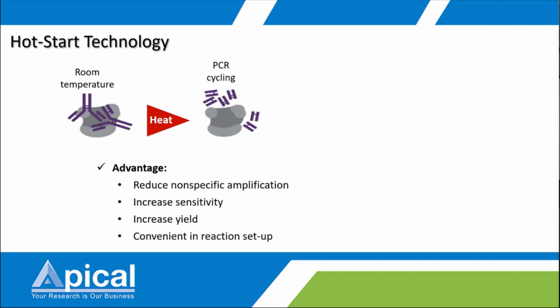Okay, so another characteristic of DNA polymerase, or I should say an advancement in DNA polymerase technology, is the hot start technology. Traditionally, during the reaction setup of PCR, primers can bind unspecifically to the DNA template, or they may bind to each other, and this mispriming can later be extended by the DNA polymerase, and it results in non-specific amplification in your PCR. So hot start technology can help to solve this difficulty.